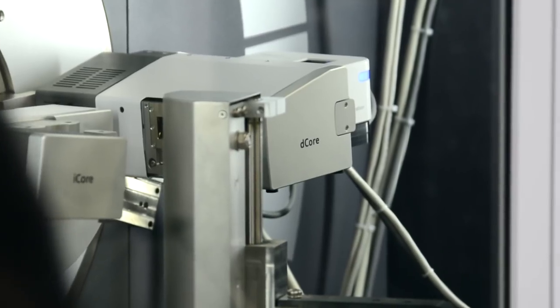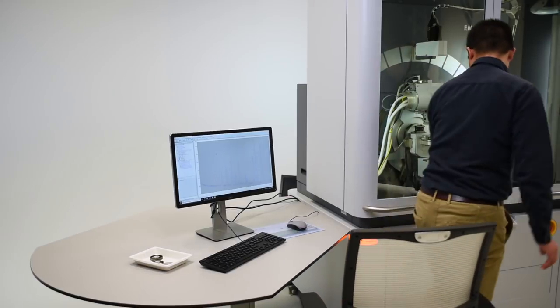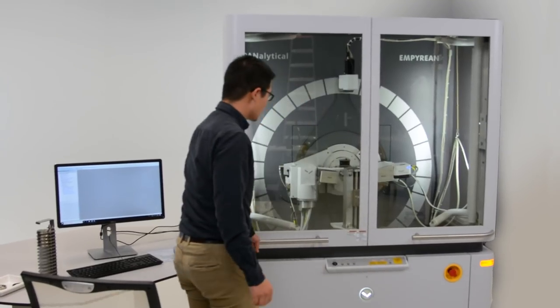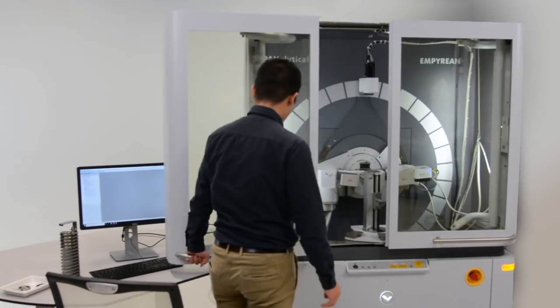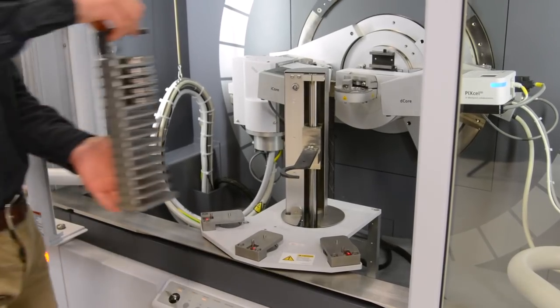The I-Core and D-Core are completely motorized prefix modules which are now automatically detected. The result is a fully recognized optical beam path. This helps to completely trust the data measured in regulated environments or by inexperienced users.